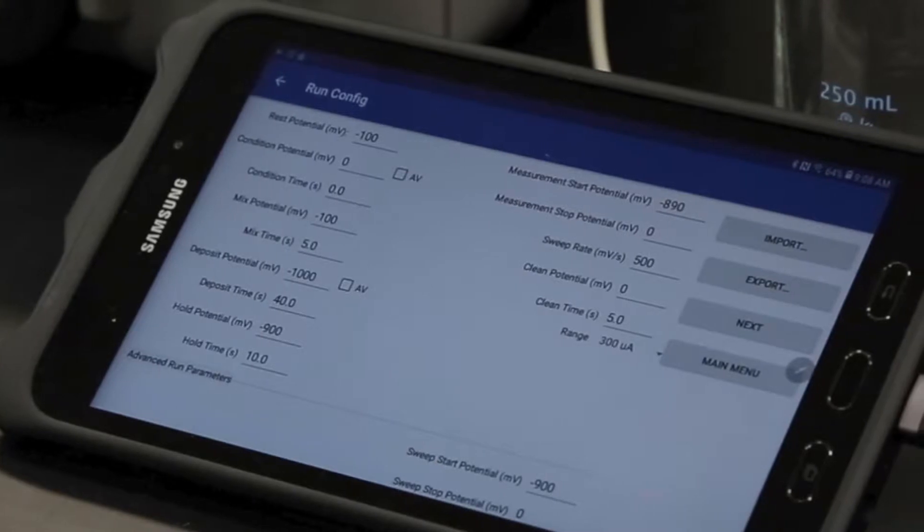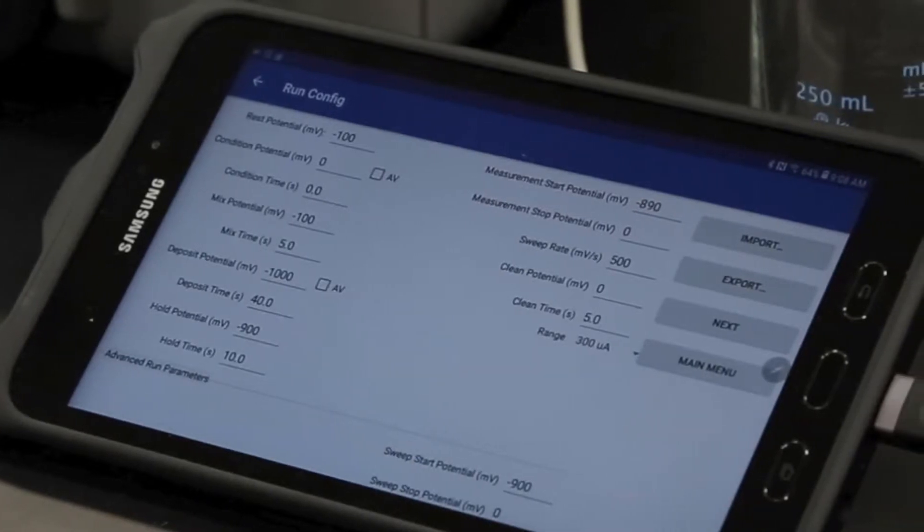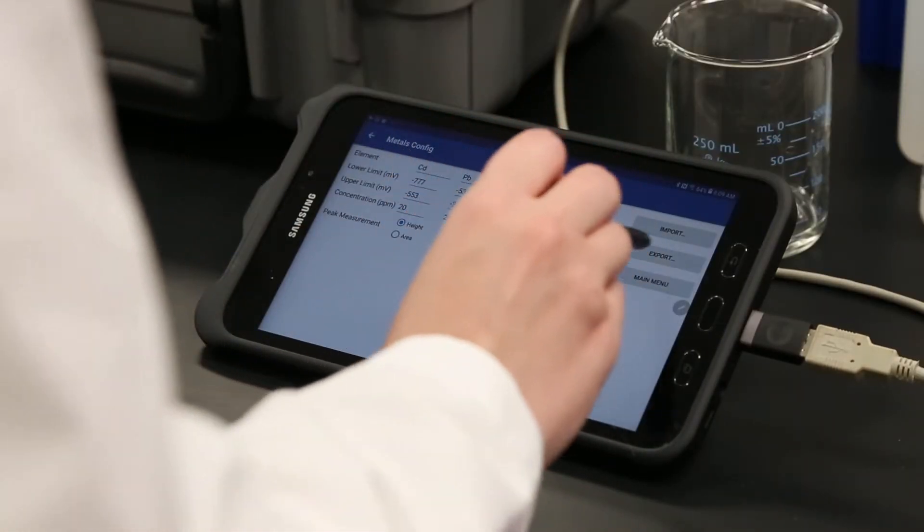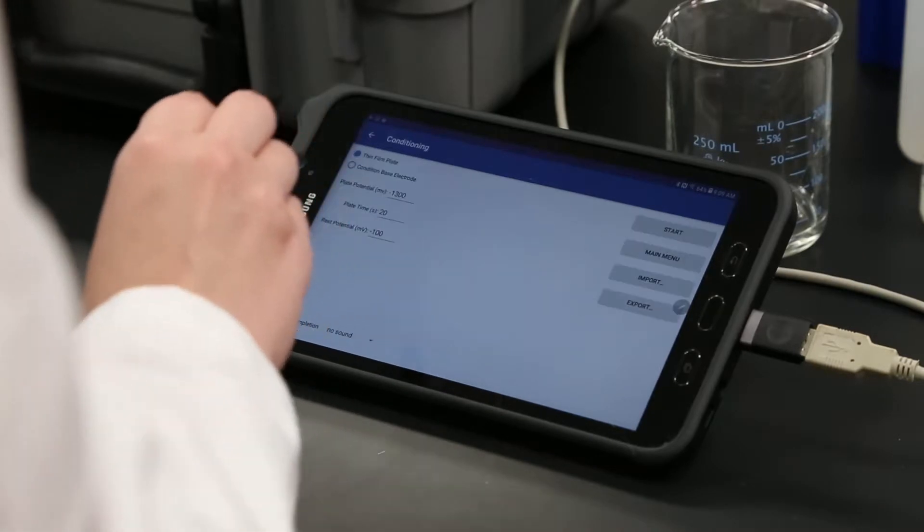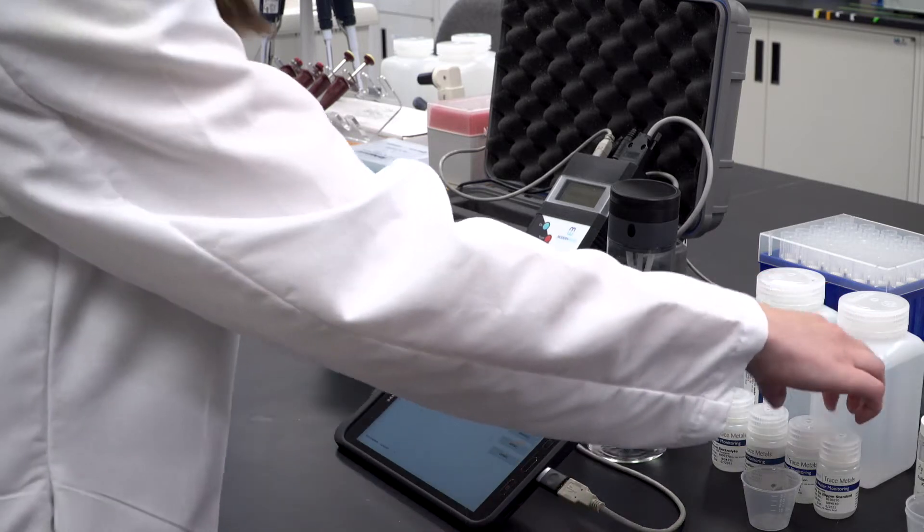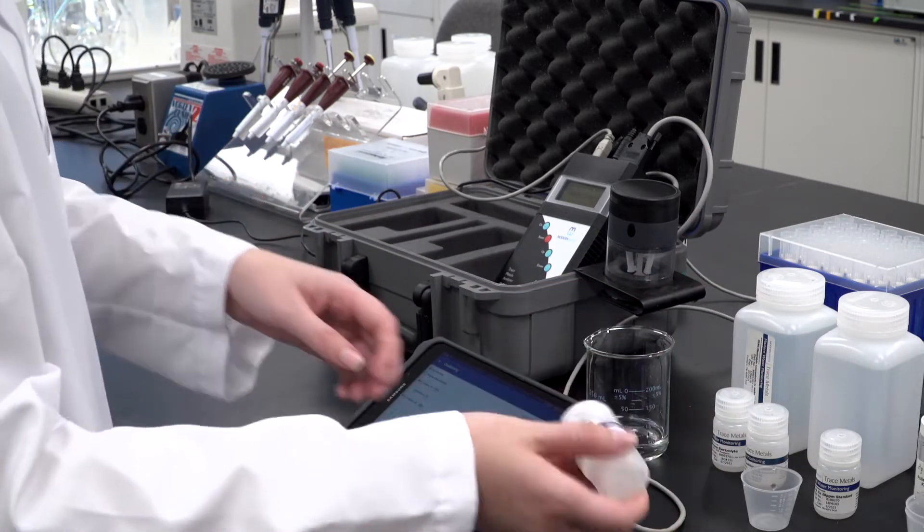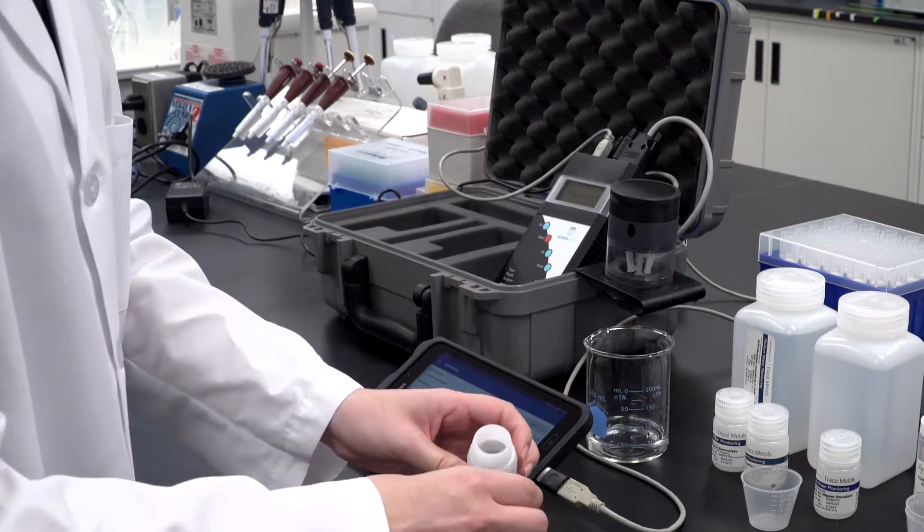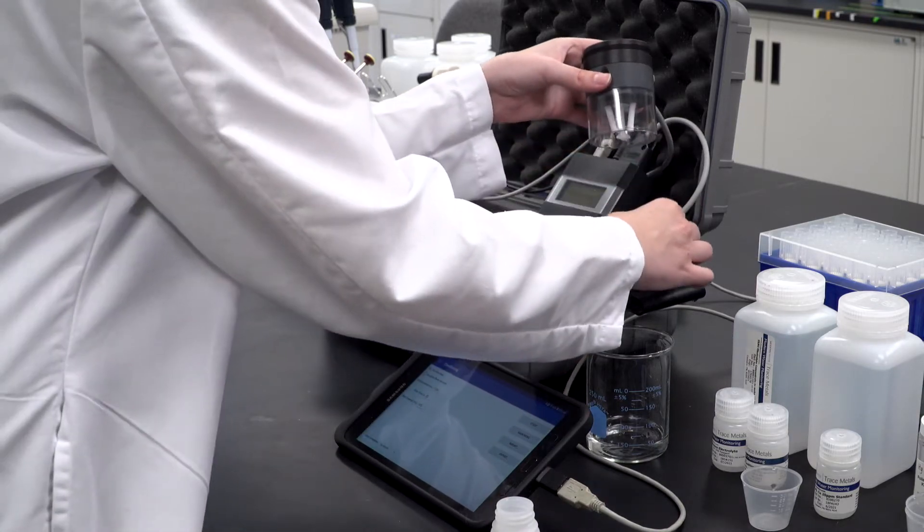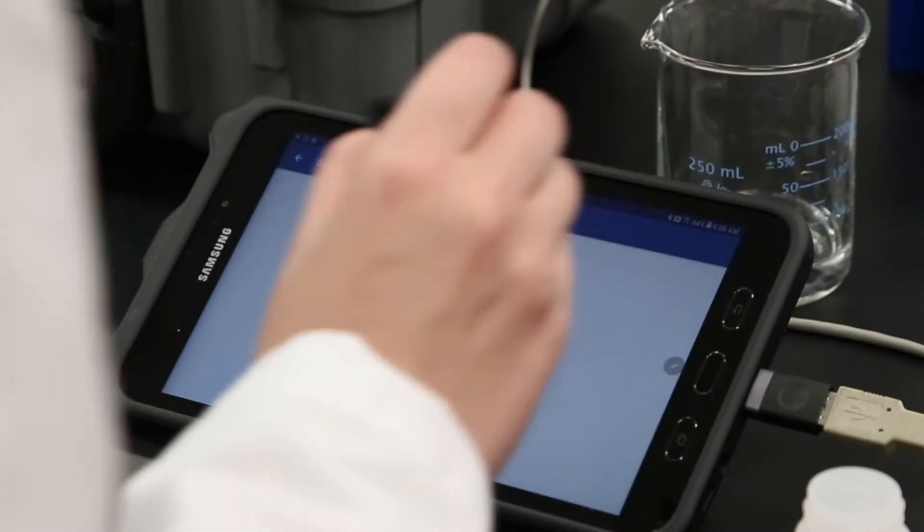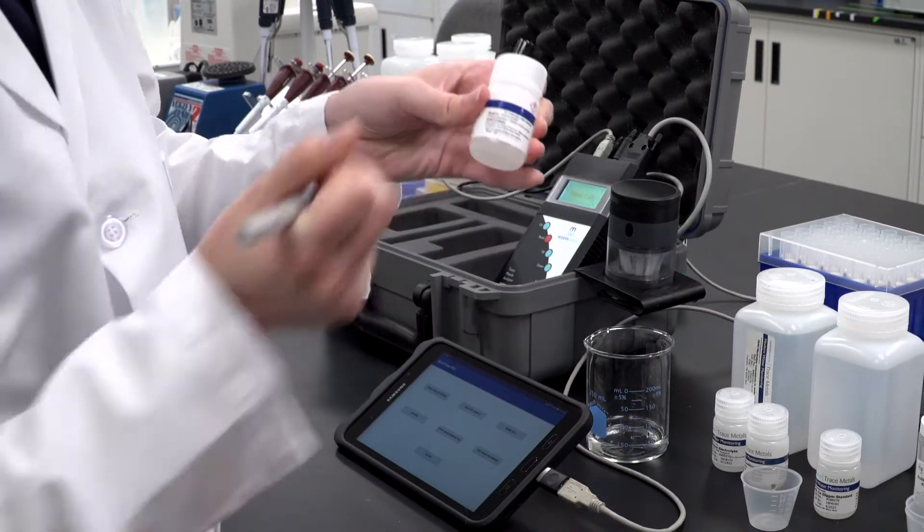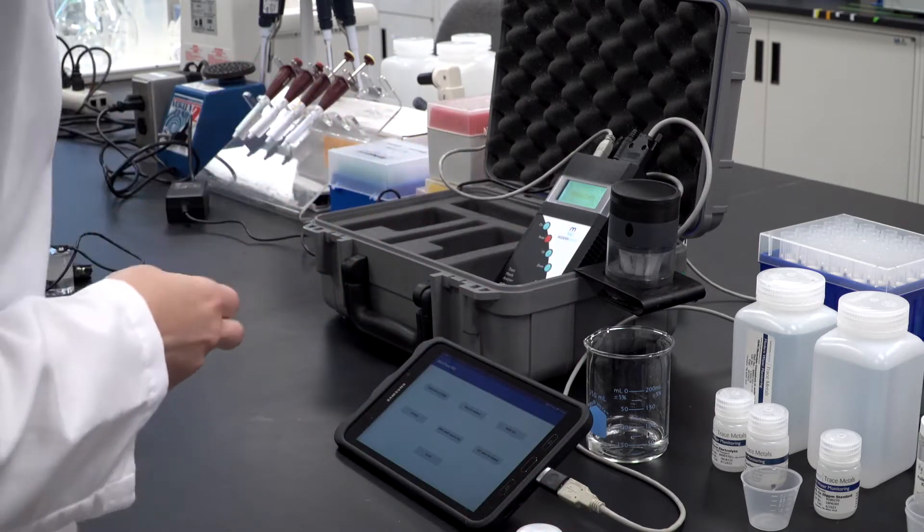The application note for each metal will describe the exact conditions for conditioning the working electrode. The Conditioning menu is accessed from the Condition Electrode button. Conditioning parameters are saved with other analysis parameters but must be separately loaded with the Import button or manually entered to match the relevant application note. To condition an electrode, fill a clean analysis cup with the contents of a bottle of the correct plating or conditioning solution and click the Start button in the Conditioning page. During the conditioning process, mark off the next open box on the bottle's label as plating solution bottles contain sufficient solution to plate an electrode five times.